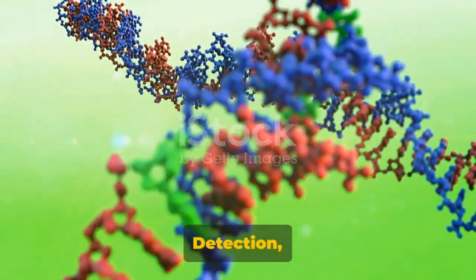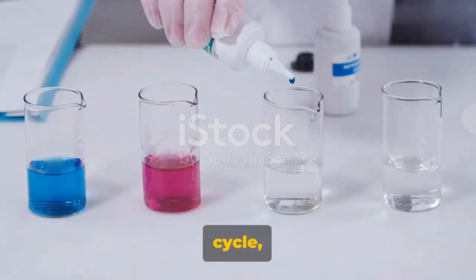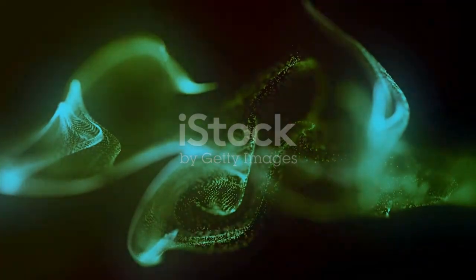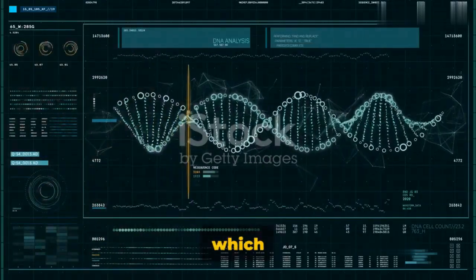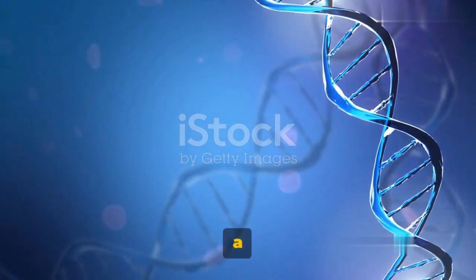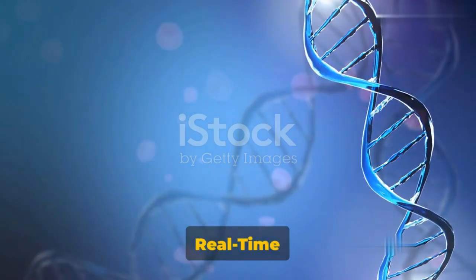We've also explored detection, where fluorescence technology comes into play. The specimen is subjected to a thermal cycle, and a fluorescent marker added to the sample brightens under a tungsten or halogen source. As the DNA sample amplifies, so does the signal, which is detected, digitized, and displayed on screen. Real-time PCR is not just a process, but an elegant symphony of science. And that, my friends, is the power and beauty of real-time PCR.